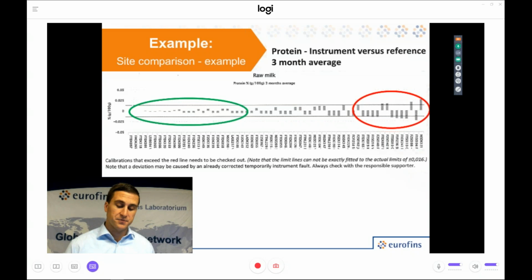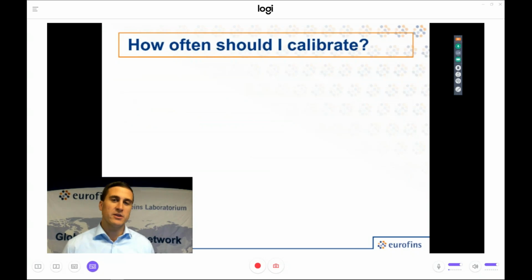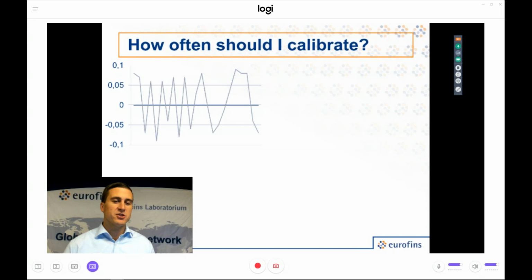So a question I often get, when looking at the normal set of calibration standards, where the customer gets the calibration standards, they will also get the results, and you will probably never hit the exact spot from the reference chemistry, which means I will often get the question of how often should I calibrate my instruments, both how often and also should I adjust the instruments. What we usually look at is the fluctuations of the calibration.